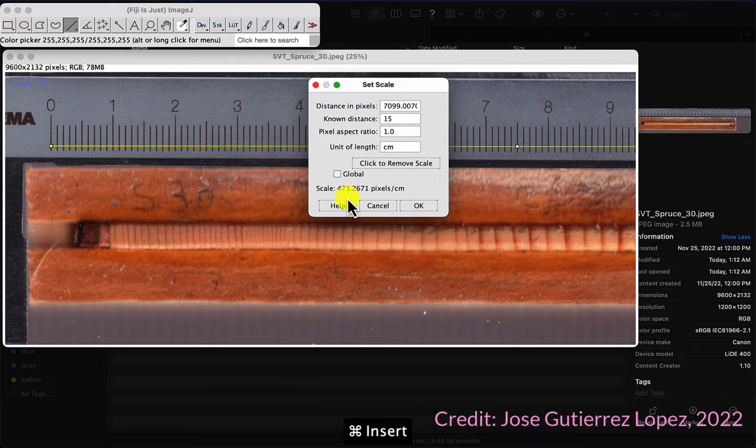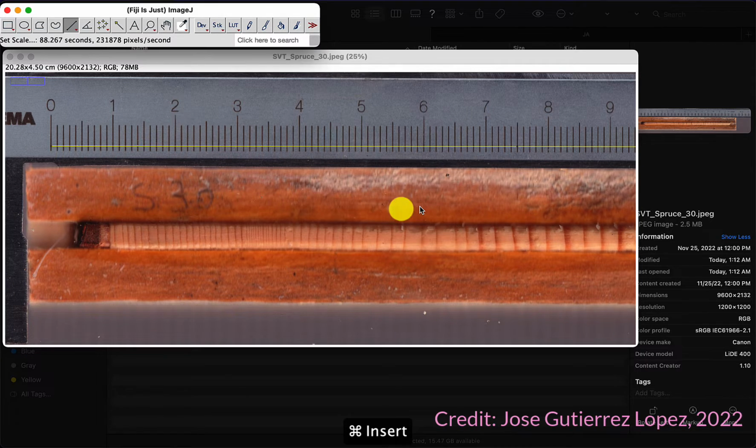I see that this image in particular is only 473 pixels per centimeter, which might be on the low side, maybe got scanned too low. I might have to rescan them. Ideally, we want maybe no less than 1,000. Okay, setting the scale.